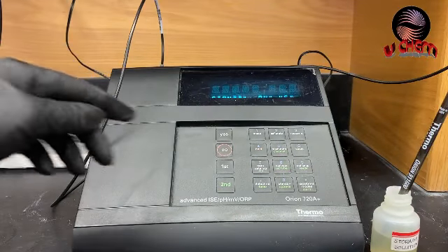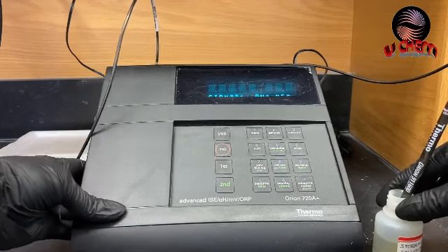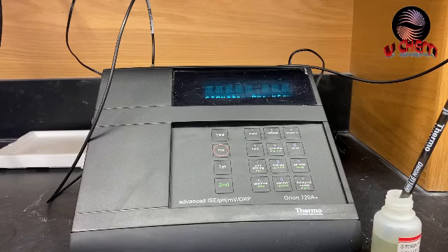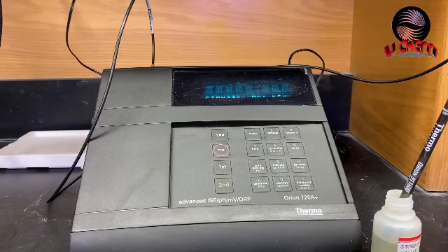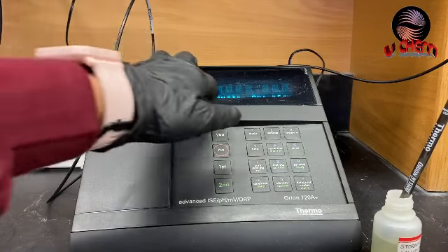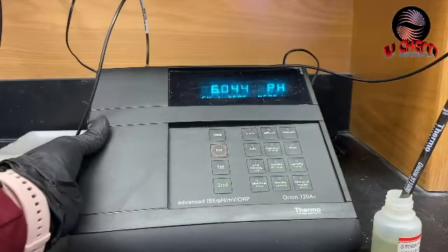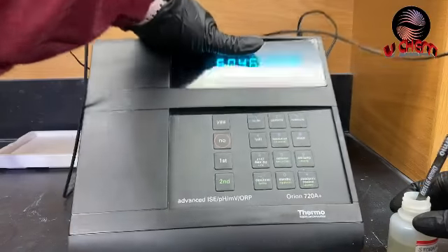I'm going to use those three buffer solutions to calibrate this pH meter. If you want to do a pH measurement in some solvent, you need to calibrate your pH meter first. So I'm going to show you how to calibrate the Orion 720A Plus. Press any key to wake it from standby, then push the calibrate button.